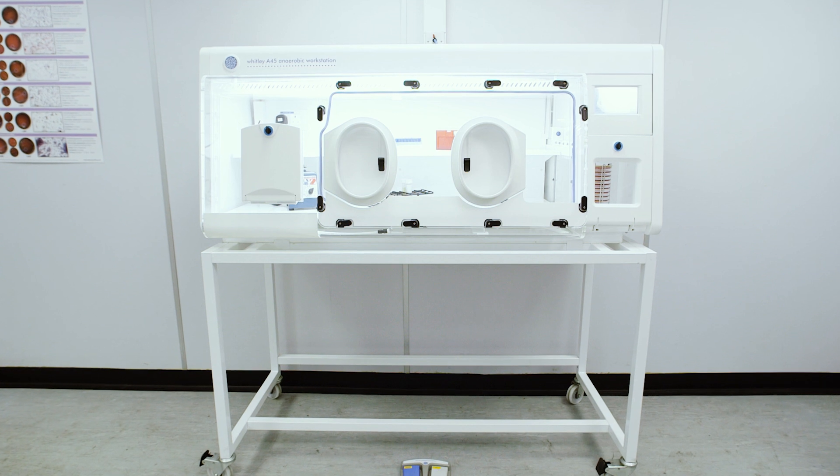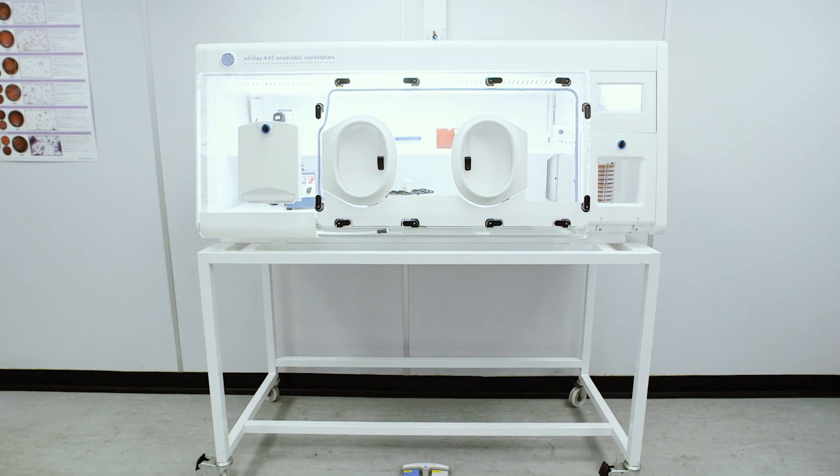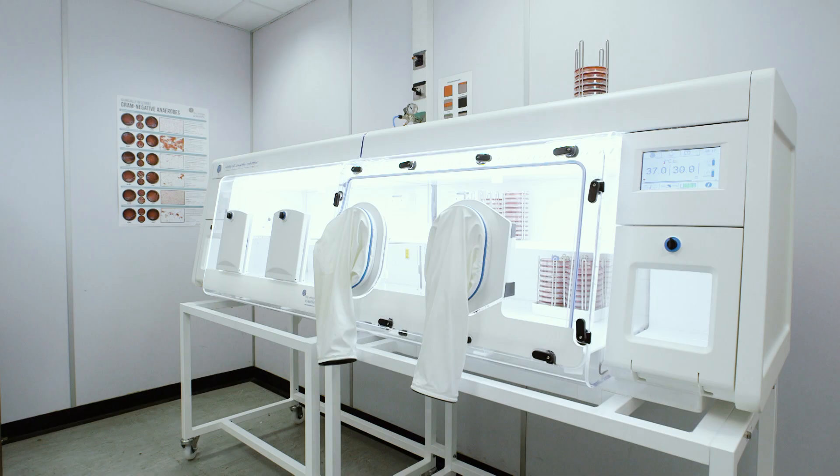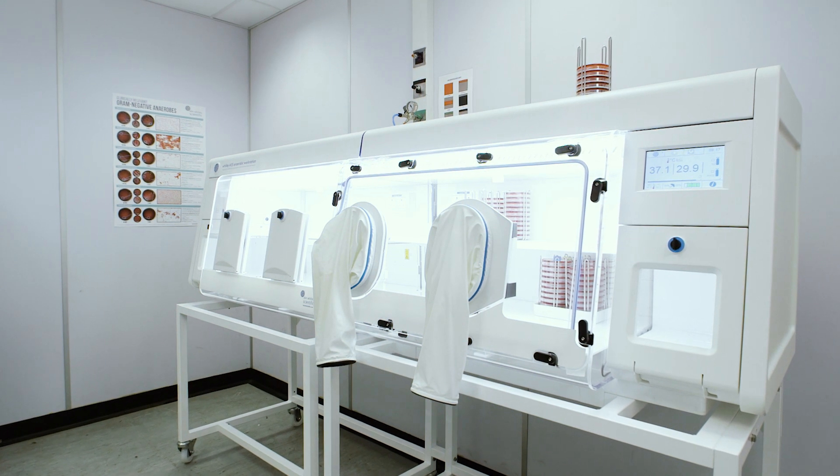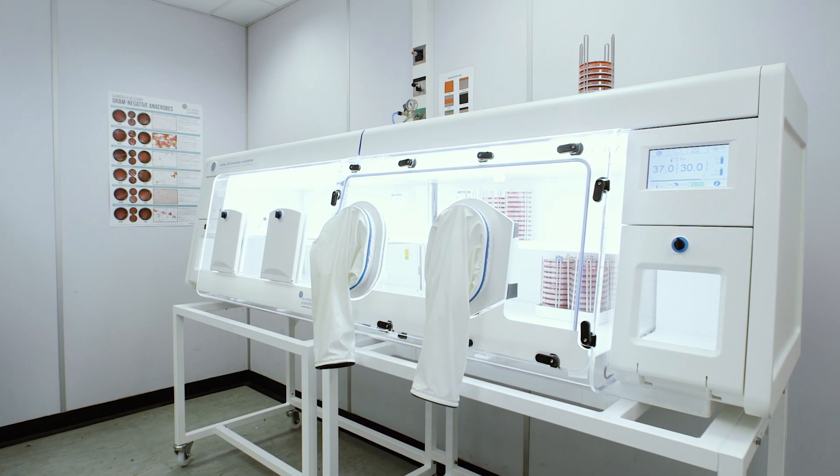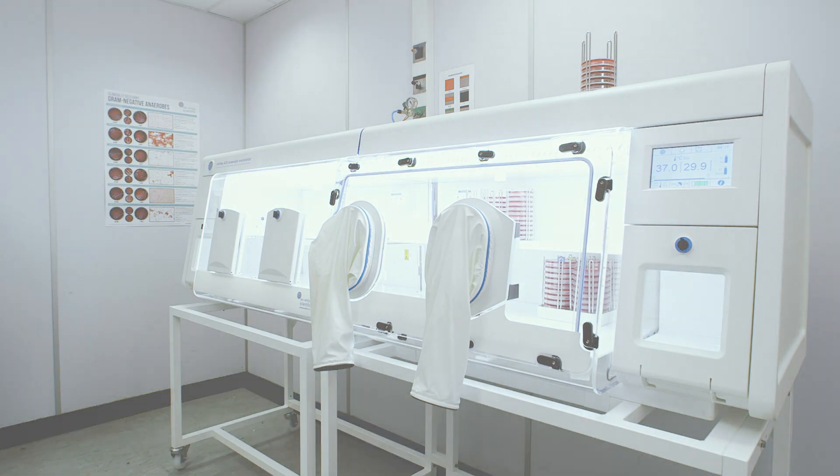As with Don Whitley Scientific's anaerobic and hypoxic workstations, microaerobic workstations are available in a number of different sizes, each thoughtfully designed for a range of different applications.